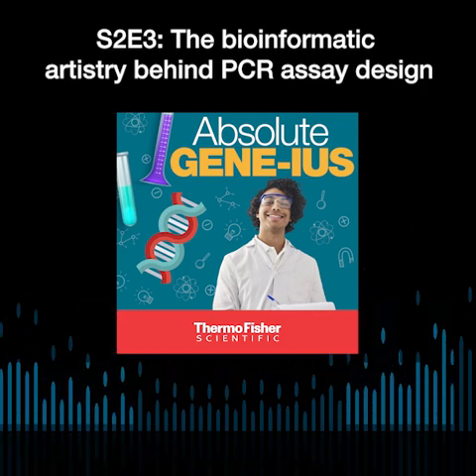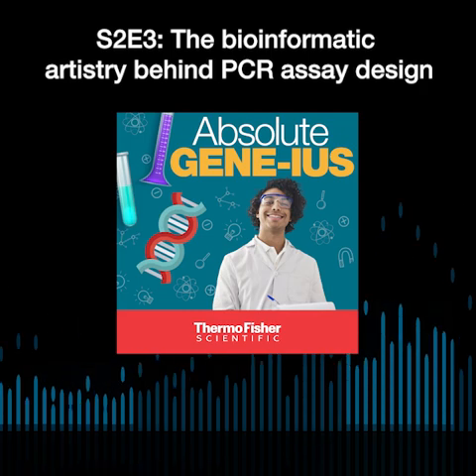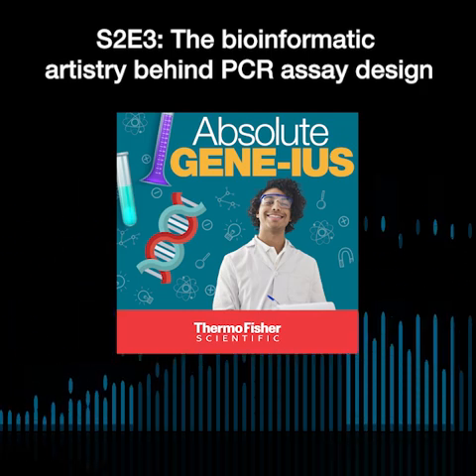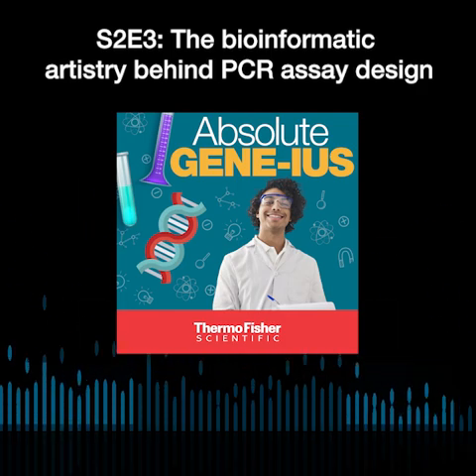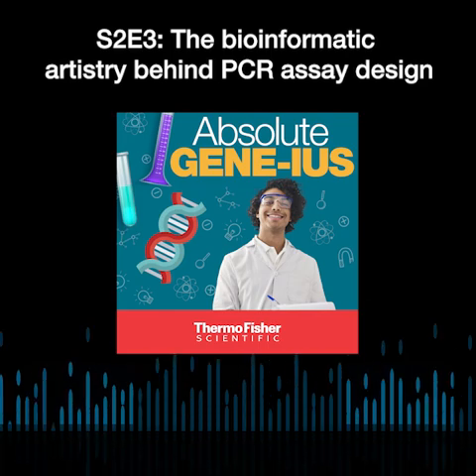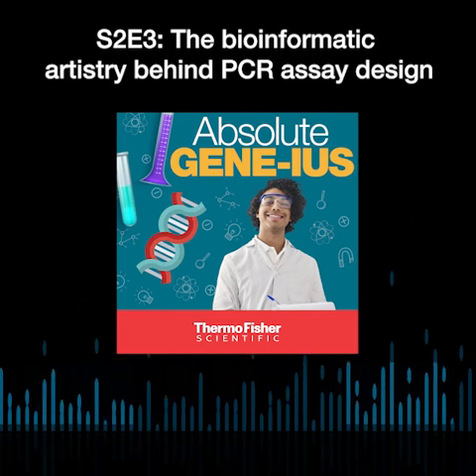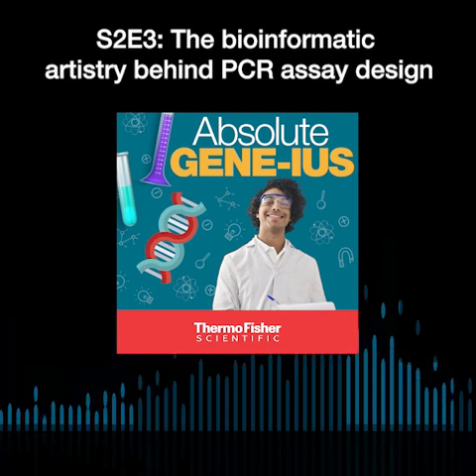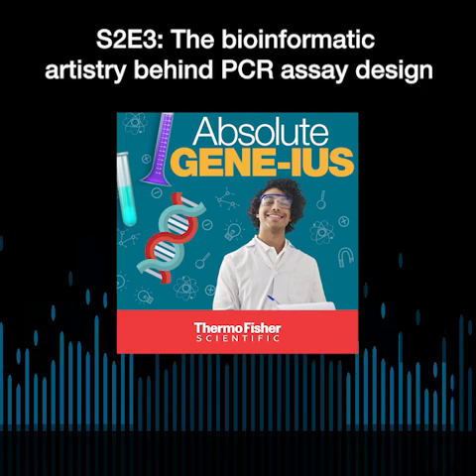We generally encourage our customers to give us the target information with reference to one of the standard formats from these databases, and the one we like is dbSNP from NCBI, where they have really cataloged the mutations, and they also list the pathogenicity, whether it's linked to a mutation or not.